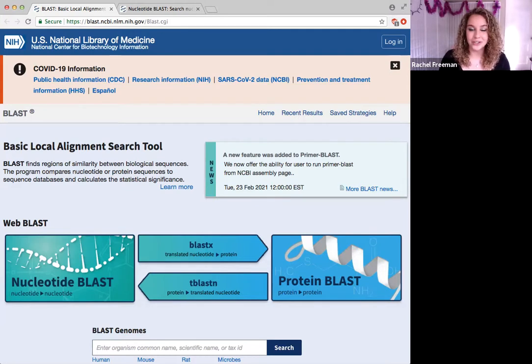it's really helpful. It's a really great resource to use, especially as you go further past just your basic intro genetics class and you're looking at evolutionary theories and virology and all different types of things where you're going to have to use genetics and compare genomes. So today let's start with the basics and the one that's pertinent to this lab that we're doing right now, the D-loop lab that we're doing in this course.